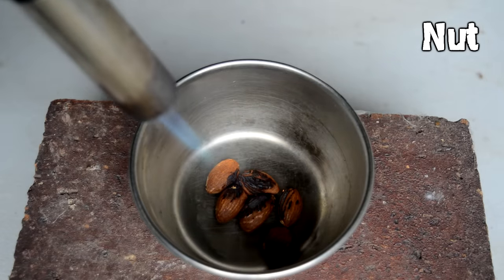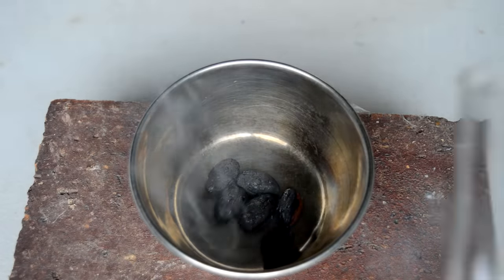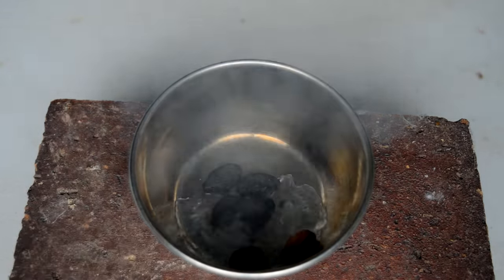Almonds also aren't that flammable, but if we add some liquid oxygen to them, they also will burn quite rapidly.